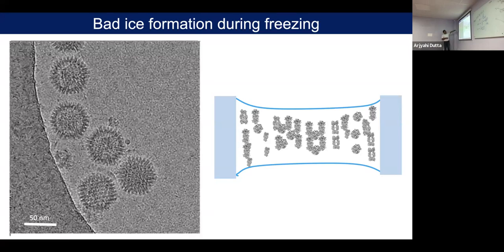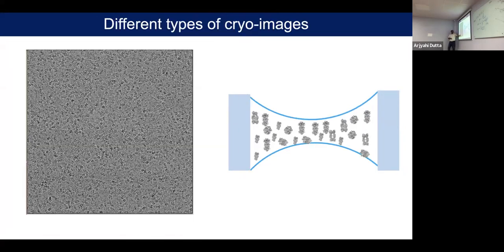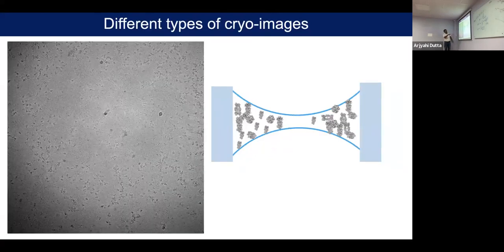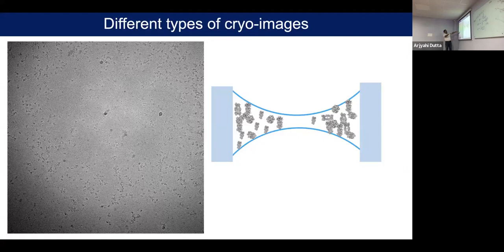Here I am showing you some more virus particles. They are very close to this carbon area because the thickness is much higher, and that thickness is also required to keep your sample there. Otherwise, it will be damaged. So if your ice thickness is changing, you can see that when there is very thin ice, particles will go away from the center area. So exactly that is happening.